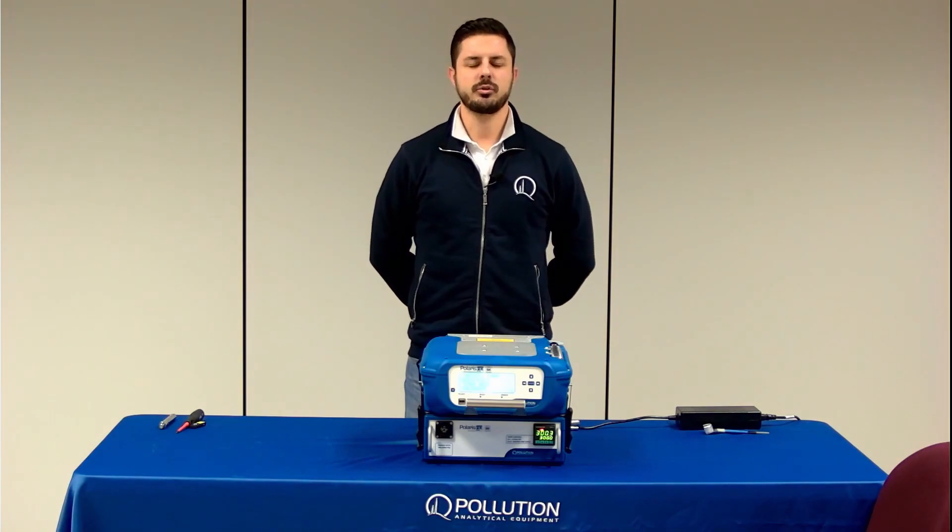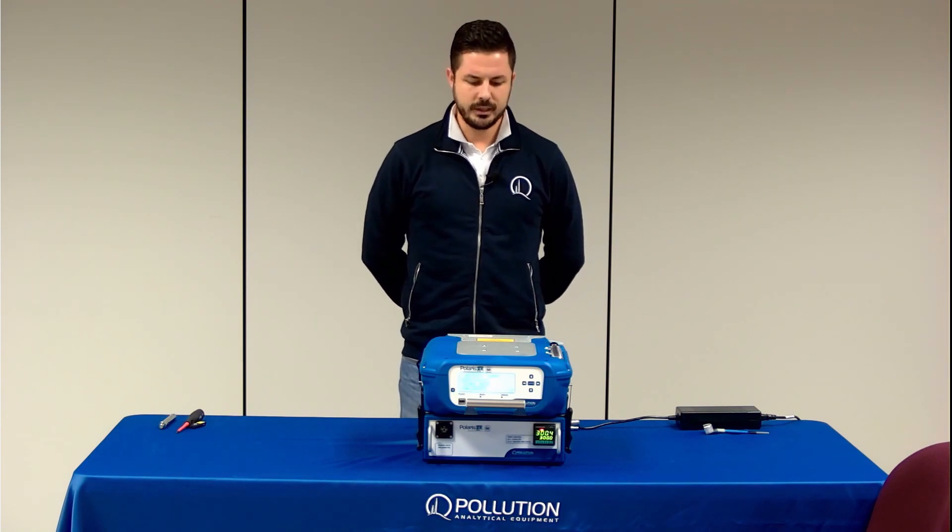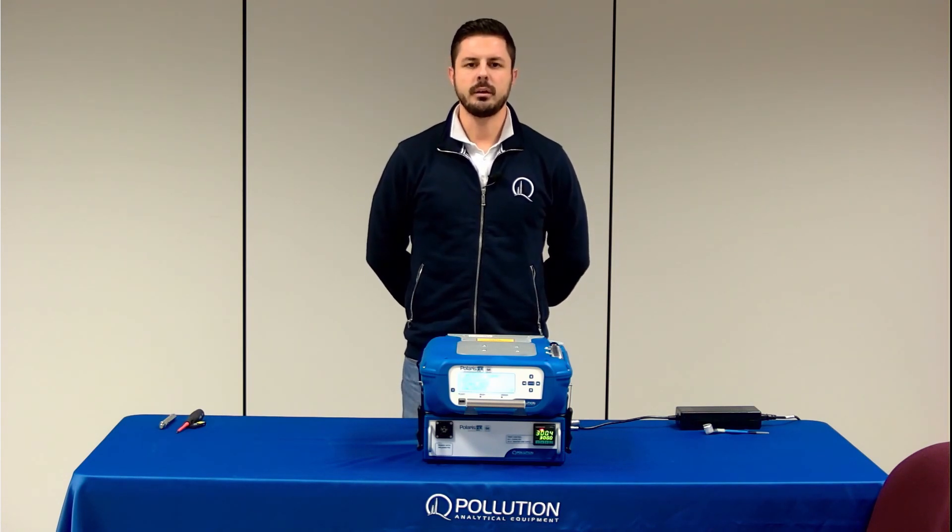Hi and welcome to this Polaris FID tutorial video. In this video I'll show you how to calibrate the analyzer through the docking station.